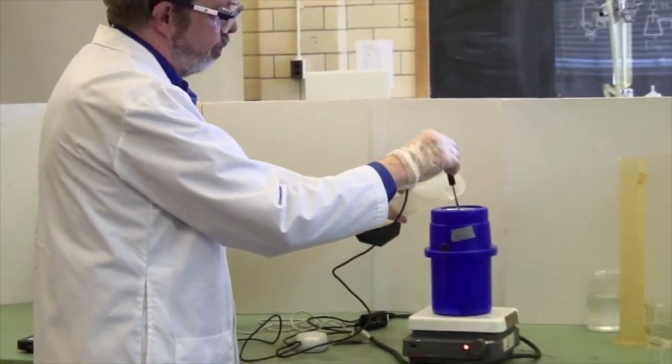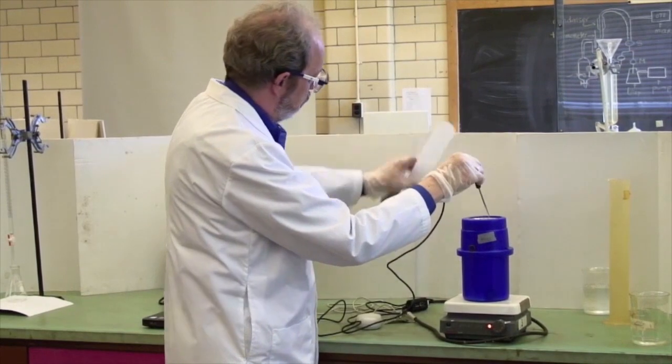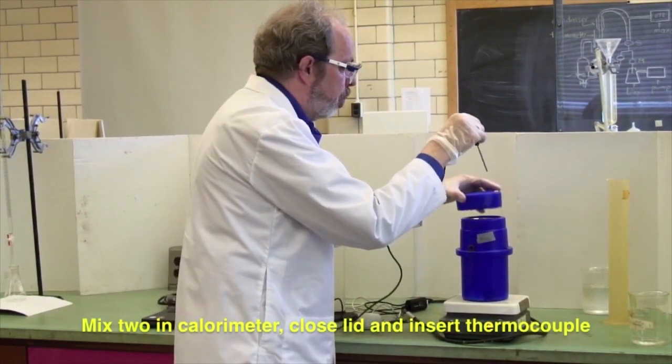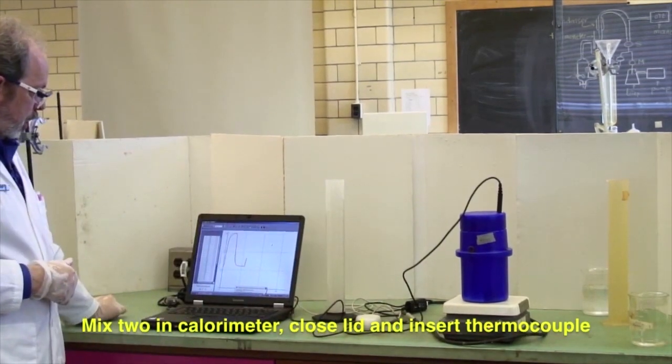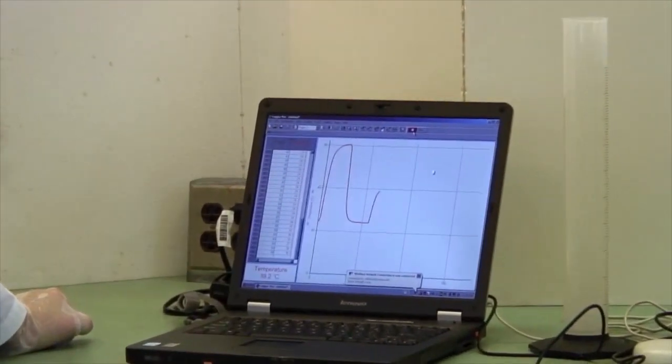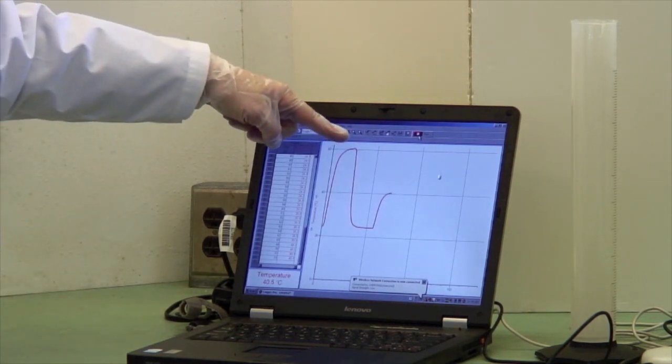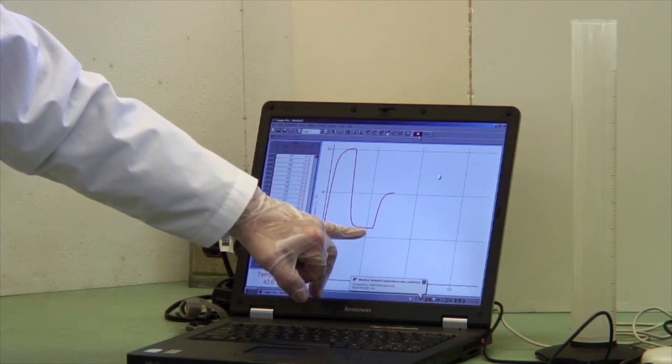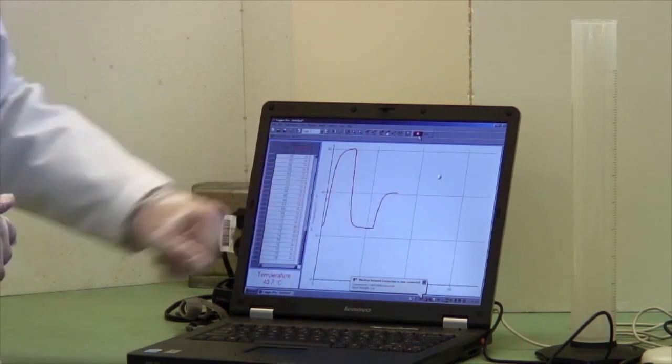Mix the two. Make sure everything has come out. Put the lid on. Put the thermocouple through the hole. And wait until you get a steady temperature. So here we have the high temperature of the hot water. This temperature down here is the cold water. And we've now got a pretty steady temperature, it's 40.7.